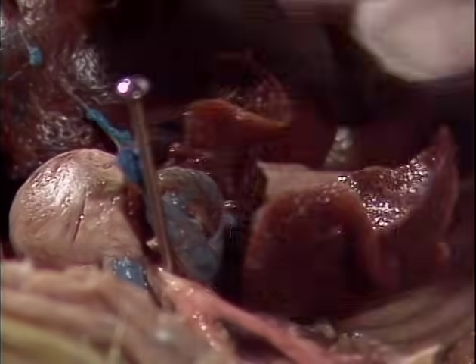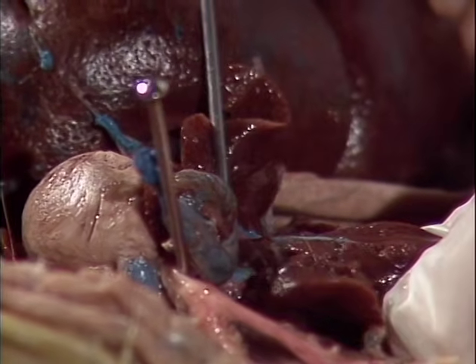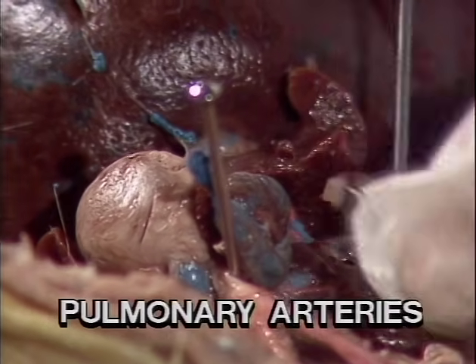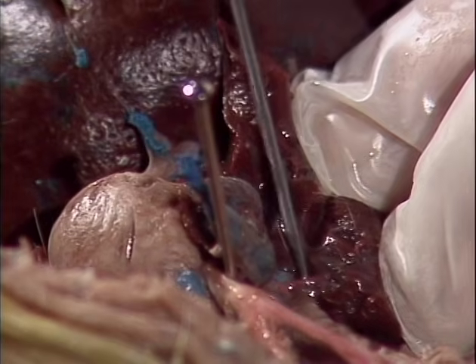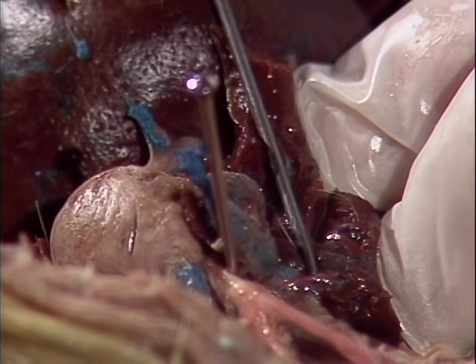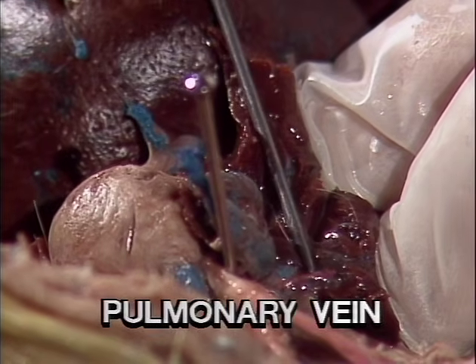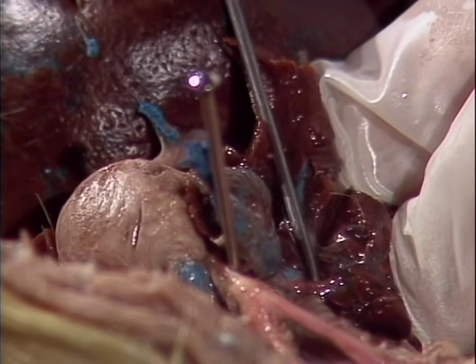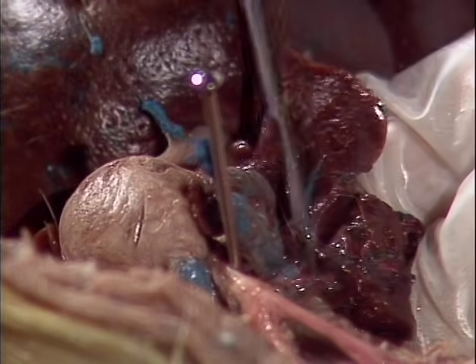We can see blue vessels entering the lungs. These are the pulmonary arteries. If we look closely, we can also see pink vessels leaving the lungs. These are branches of the pulmonary vein. This completes the respiratory system of the rat.